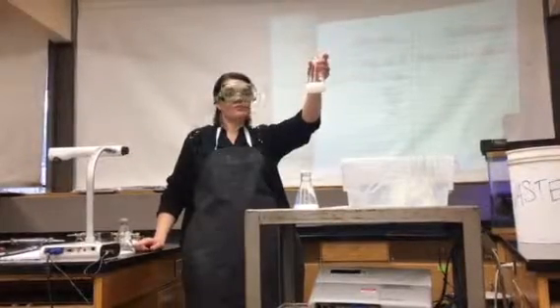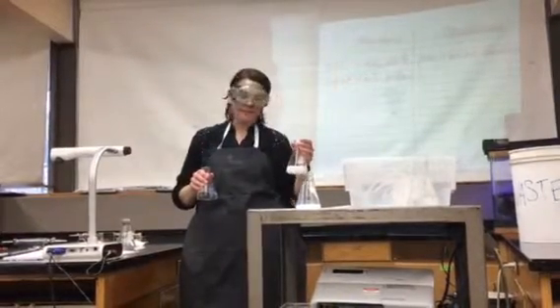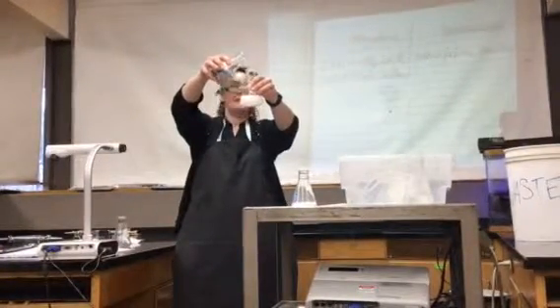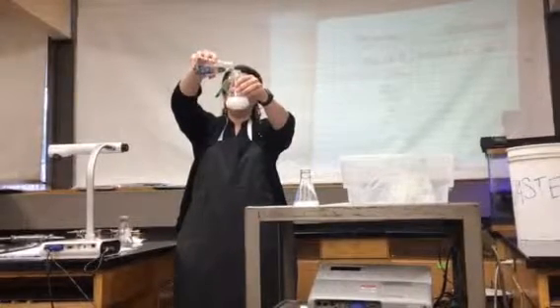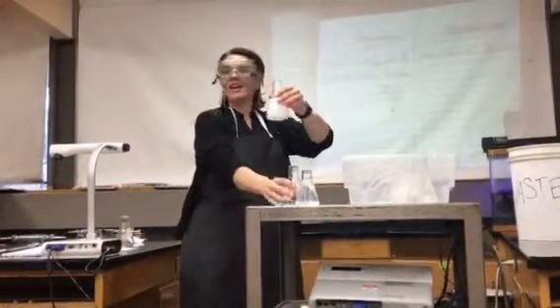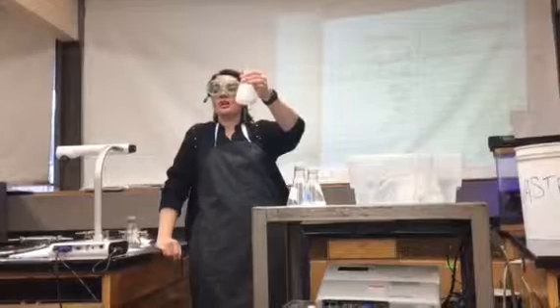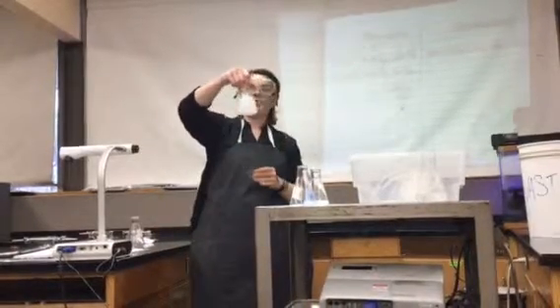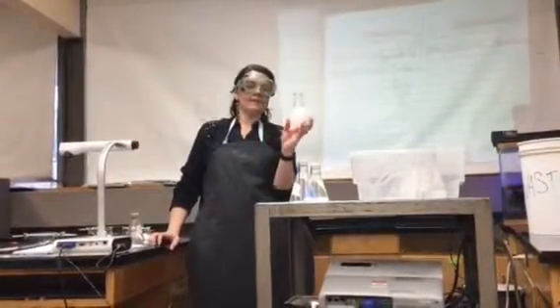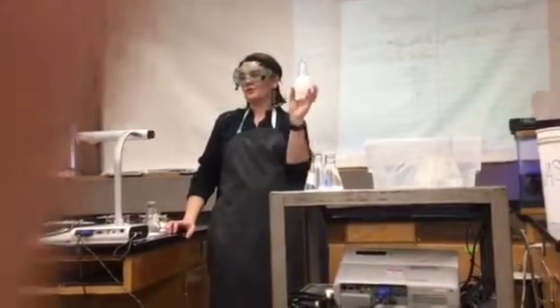Any other suggestions? Put B in there. What do you think's gonna happen? What did B do last time? Think it'll turn pink? Who thinks this will turn pink? You ready? It did turn pink. It started to turn pink, didn't it? So we know that it probably would have turned it pink if it was strong enough. But it failed. I will tell you, B would have turned it pink if it was strong enough. But the acid in here is really strong.